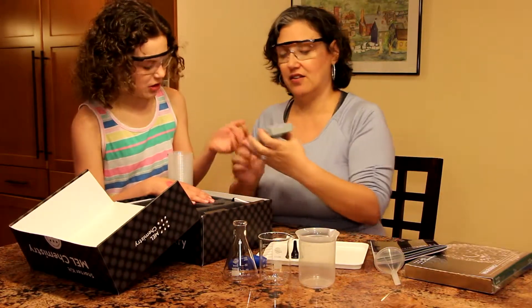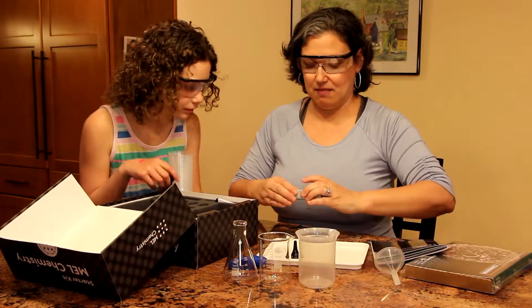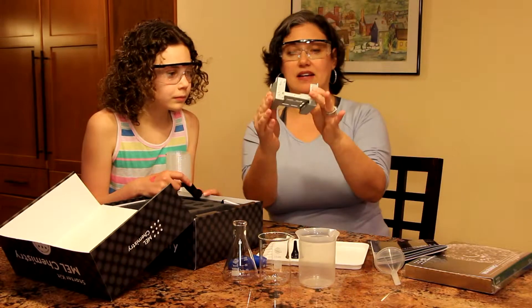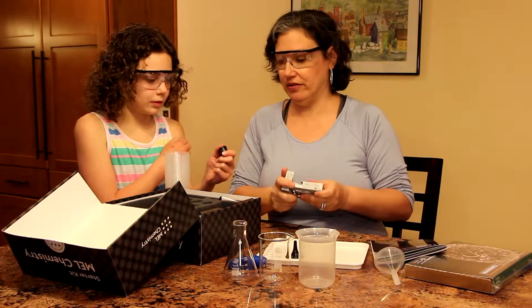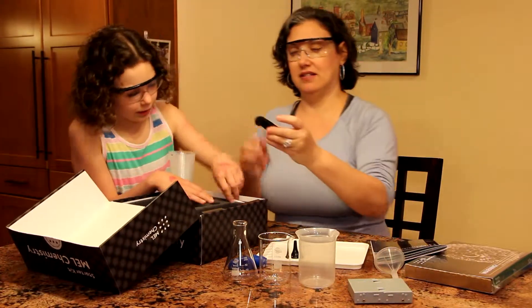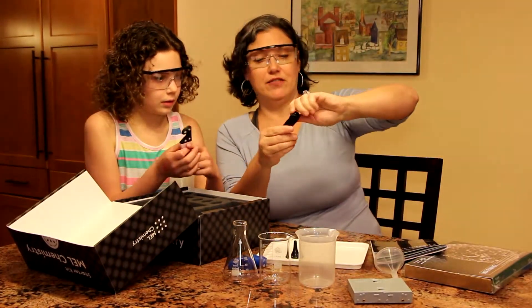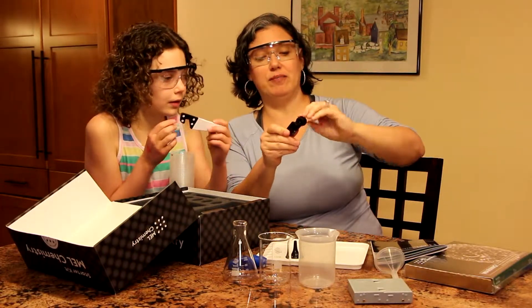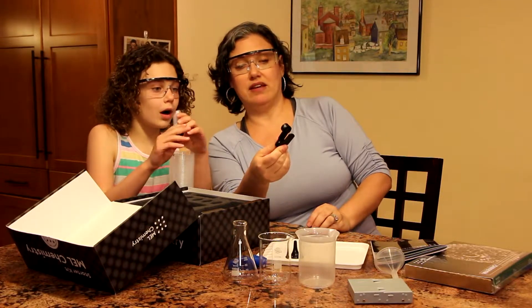And batteries. Oh, this is a mini flame stove to keep the flame inside and protected. And there's this — a clip. So we can clip things. Oh, that's a microscope. That's for your phone. I'll bet you clip that so that you can see things close up with it.